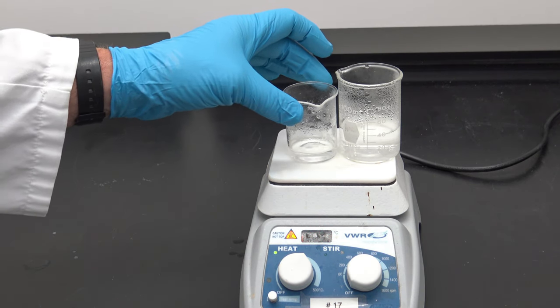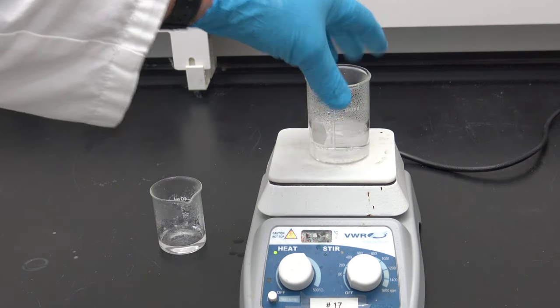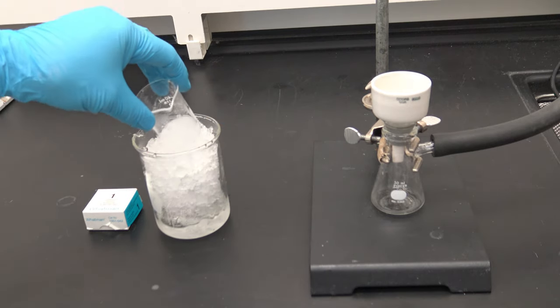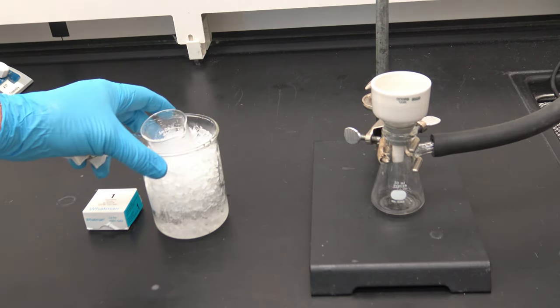And it looks like I'm all dissolved. I'm now going to set that on the countertop to cool slowly and let it recrystallize. You can already sort of see crystals starting to form. The beaker has been sitting there for about 10 minutes now and it's cooled to approximately room temperature. I'm now going to place it in an ice bath to further precipitate out salicylic acid and let it stand for about 5 minutes.